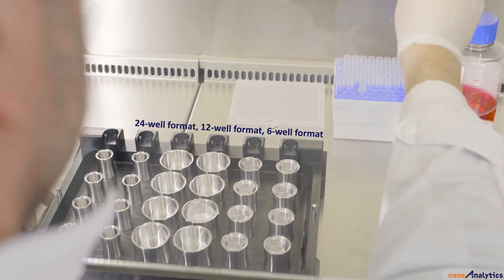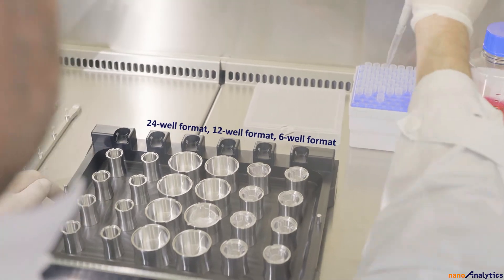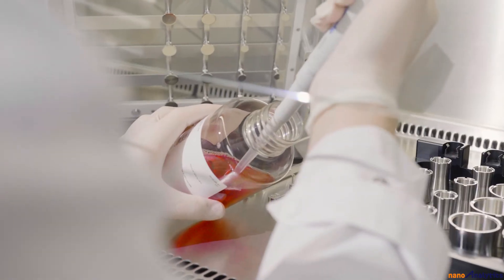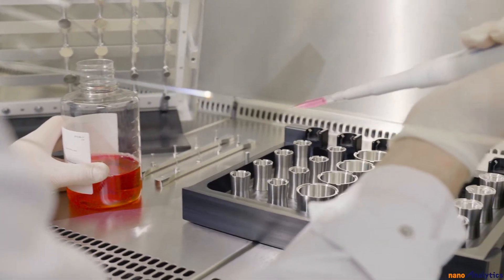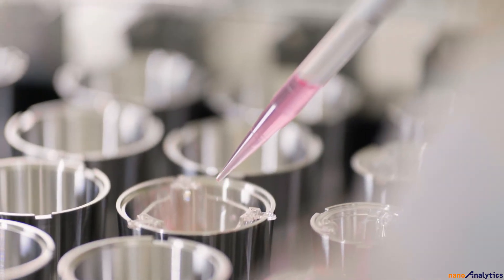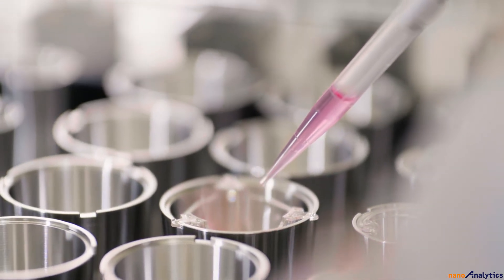Single-piece stainless steel pots serve as bottom electrodes and as supports for the cell culture inserts. Except for the cell culture inserts, no additional device-specific disposables are required to run the device.